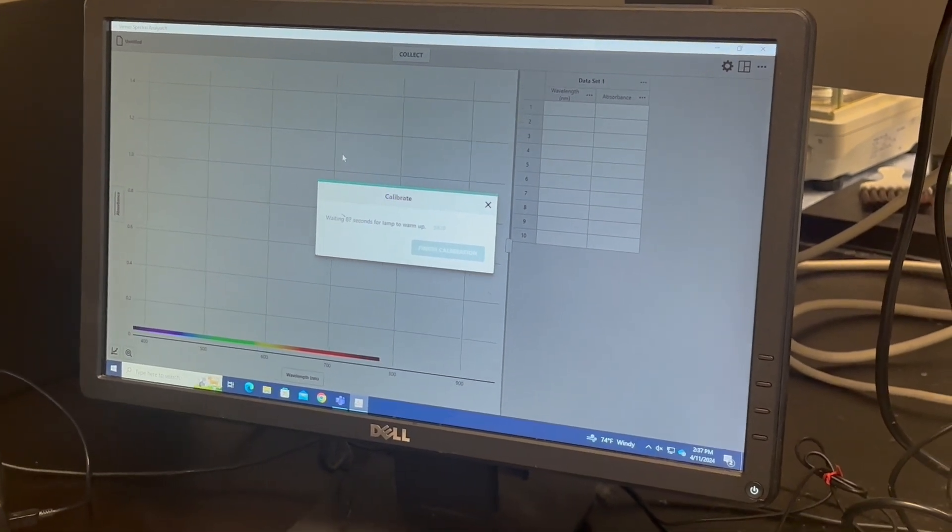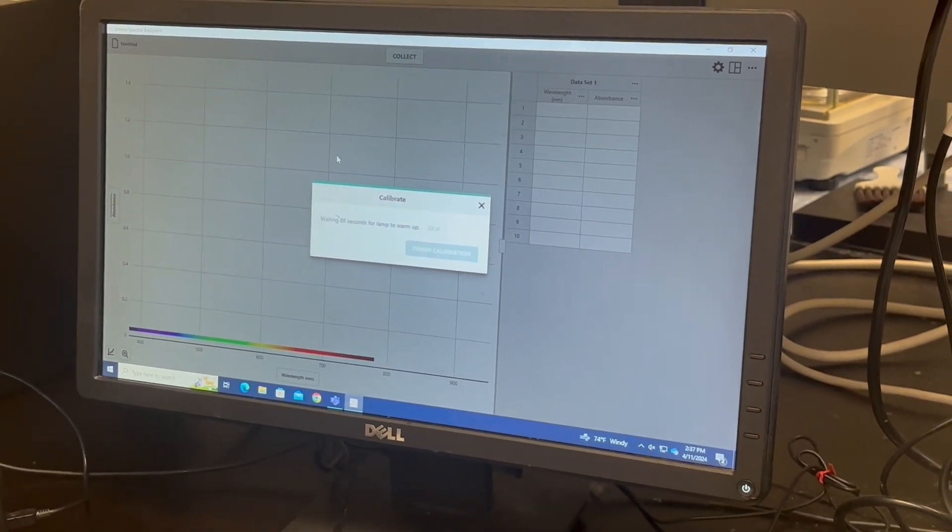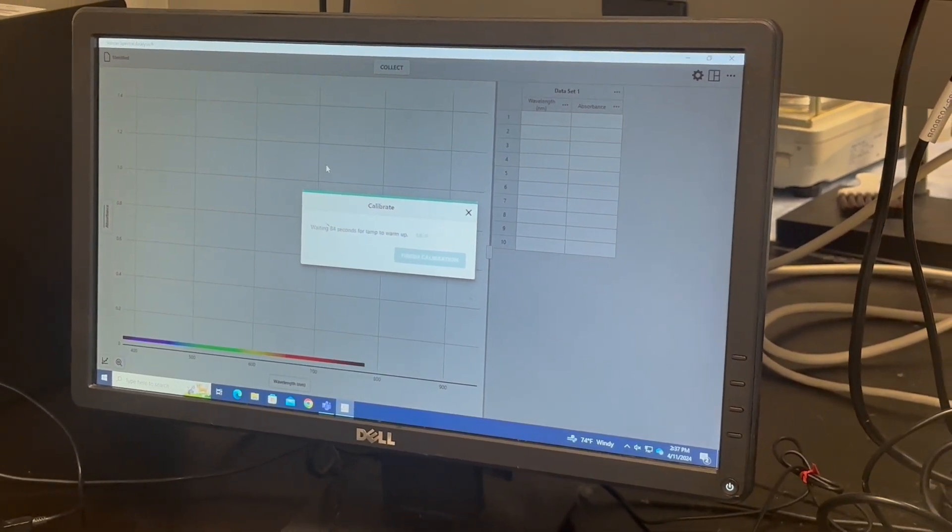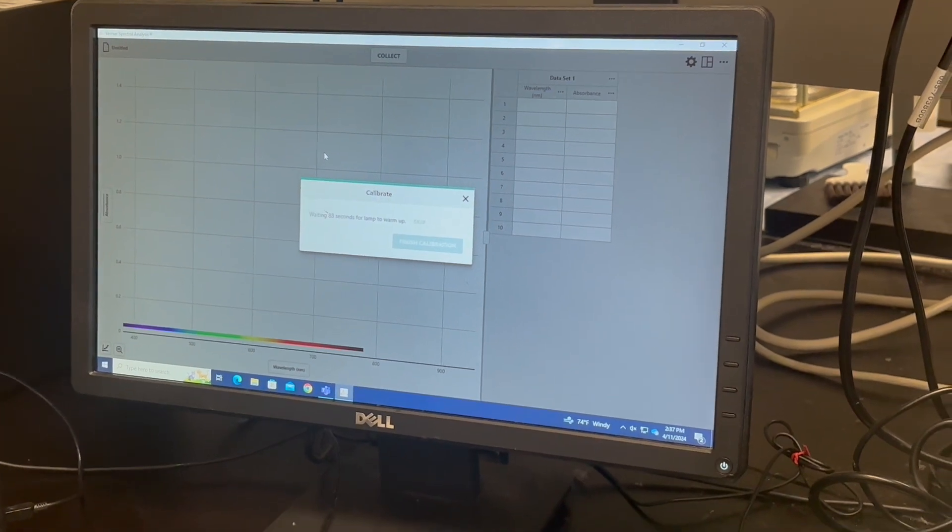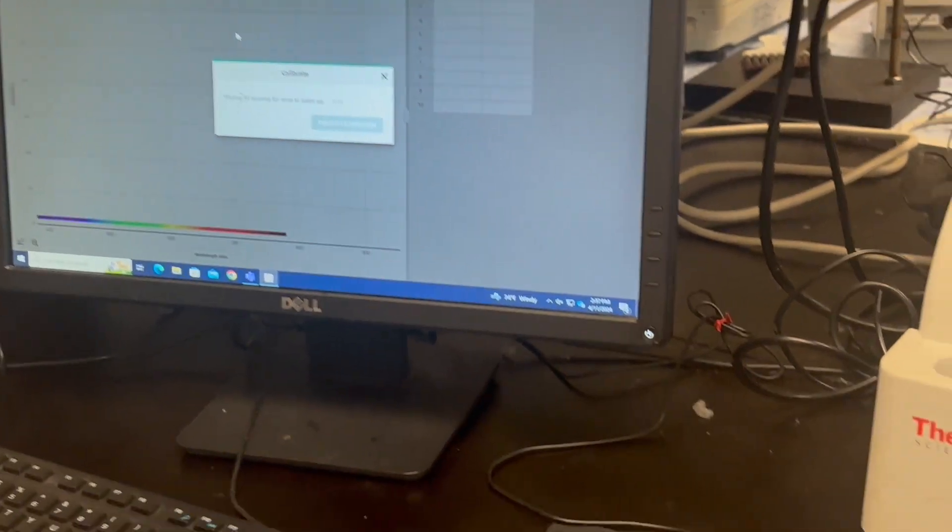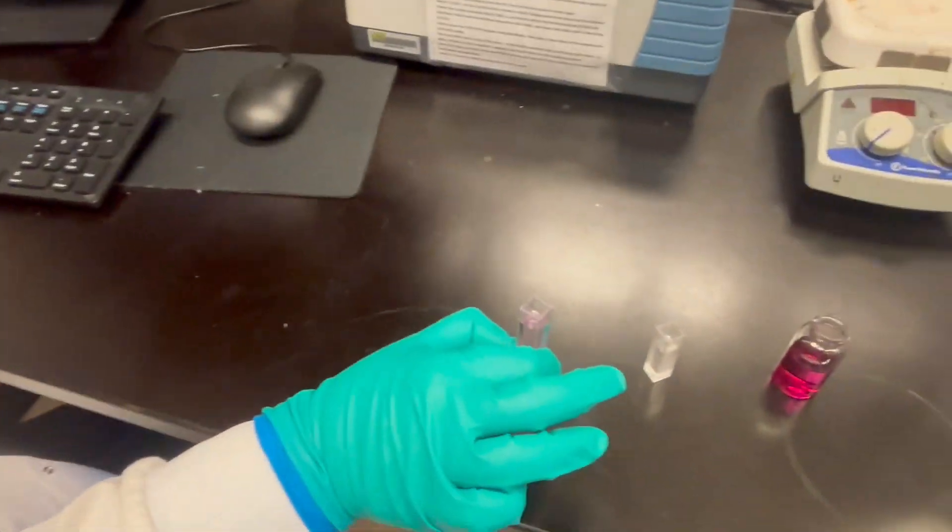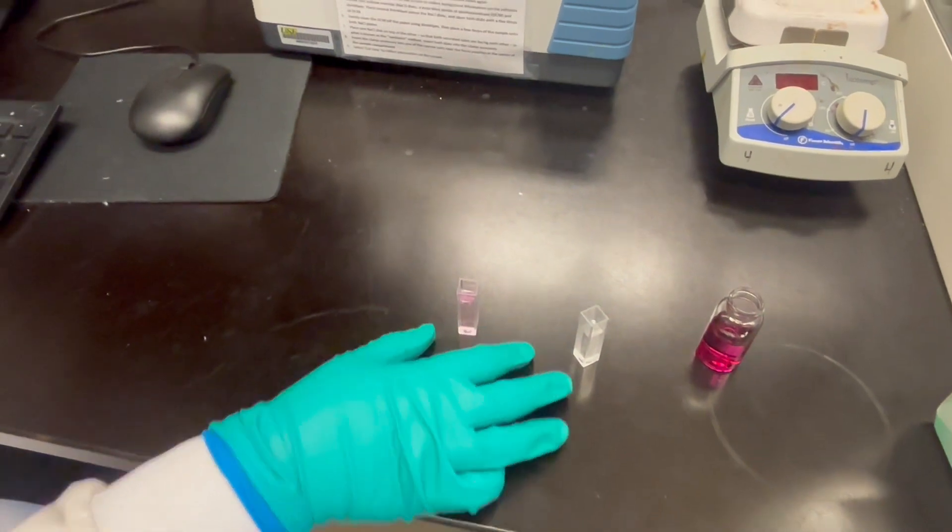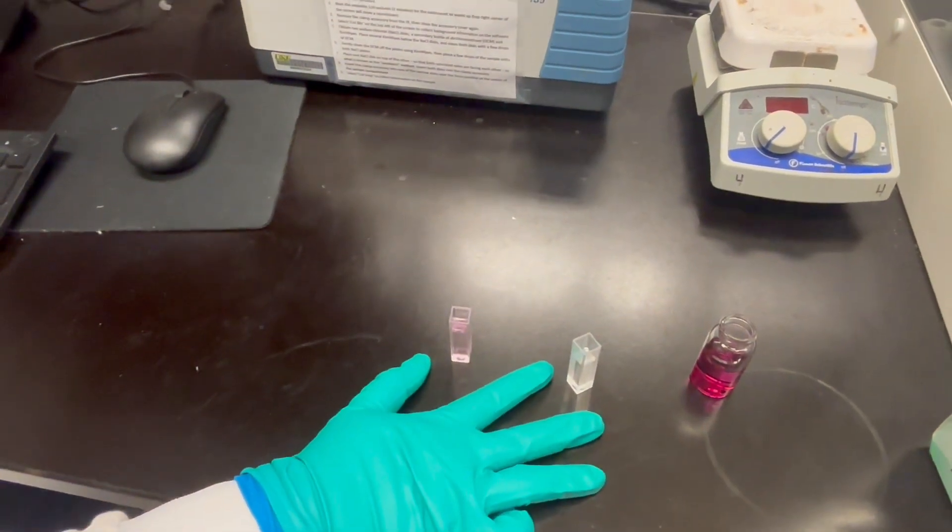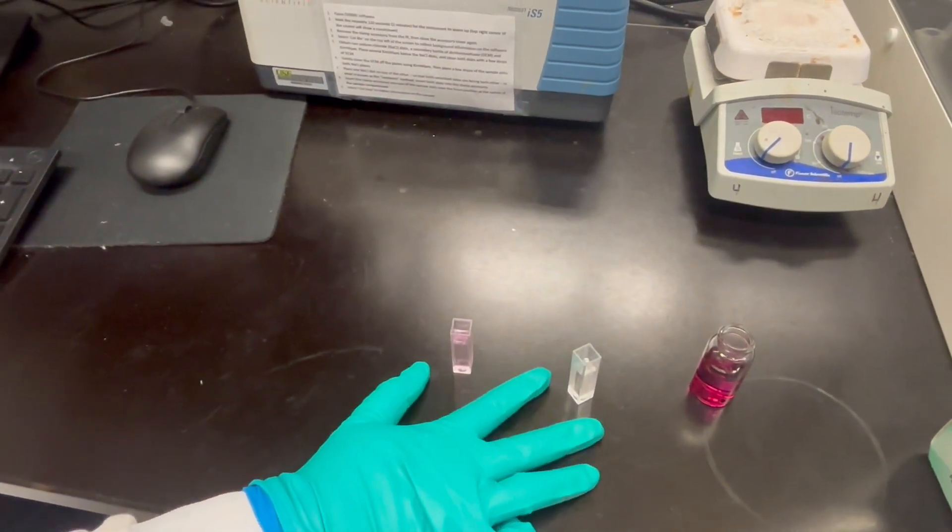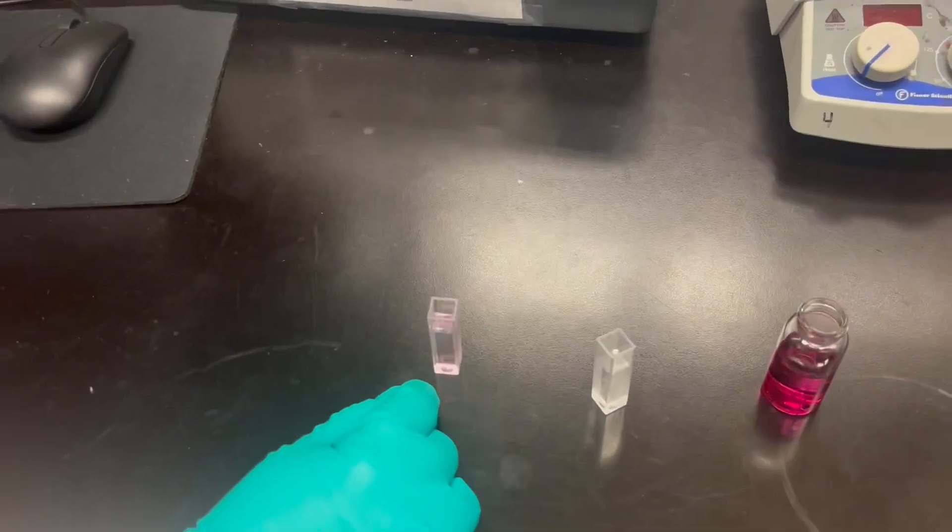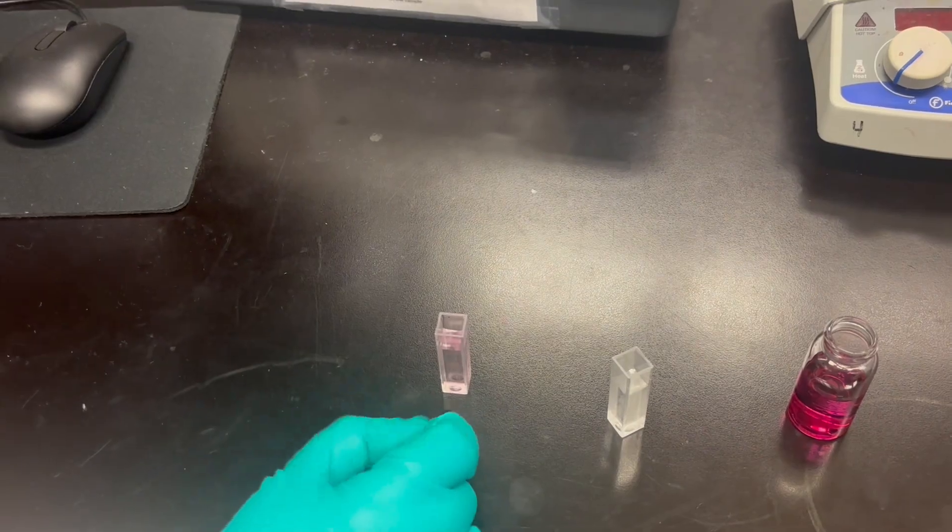And then it takes a minute for the lamp to warm up. While you're doing that, I would recommend prepping your solutions. We have two over here that we will be using. This is our blank, which is just DI water. And then this is our sample in DI water.